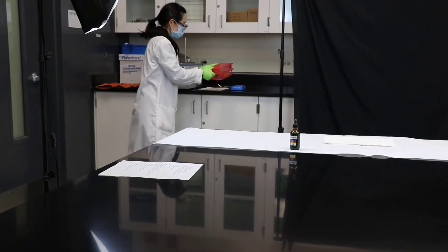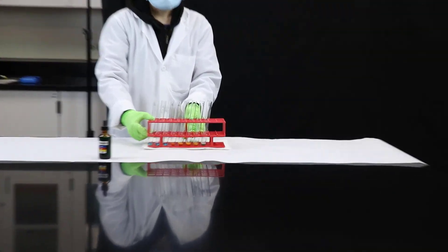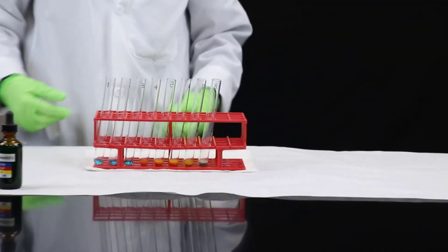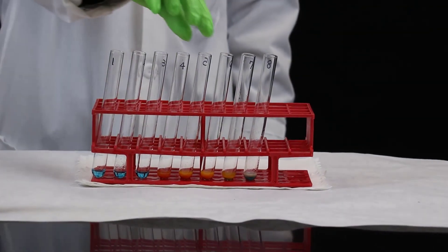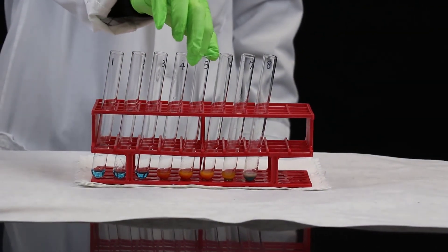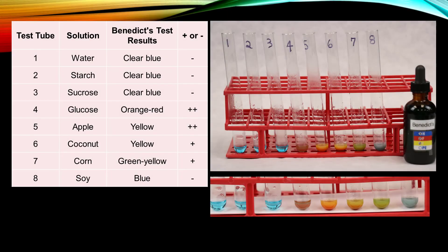Record your results. Clear blue indicates the absence of reducing sugars, or negative. Green-yellow with precipitate indicates trace to low levels of reducing sugars, noted as plus. Orange-red with precipitate indicates moderate to high levels of reducing sugars, noted as plus plus.